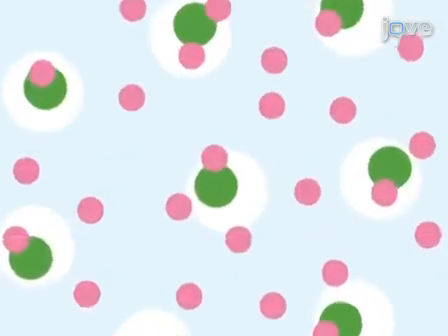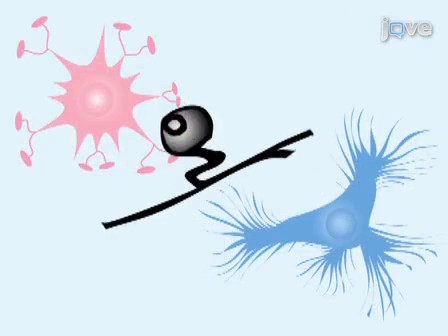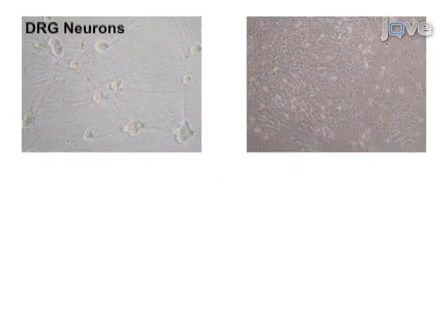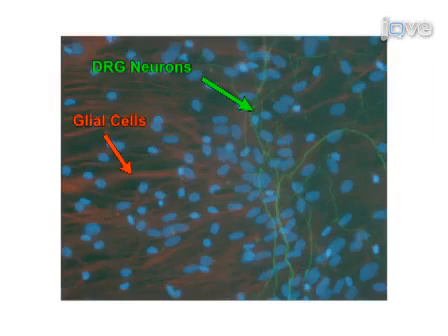The final step of the procedure is to observe the axon growth and cell adhesion and carry out cell staining and quantification analysis. Ultimately, results can be obtained that show DRG neuron growth is influenced by heterogeneous glial cells through time-lapse recording and immunofluorescence microscopy.